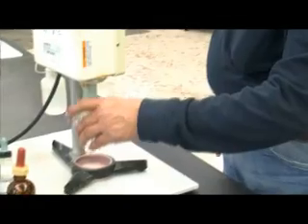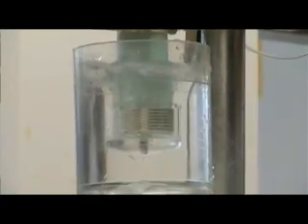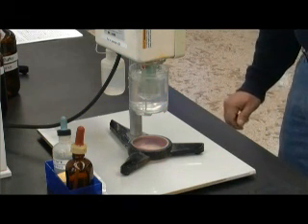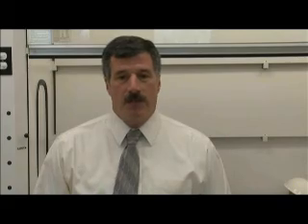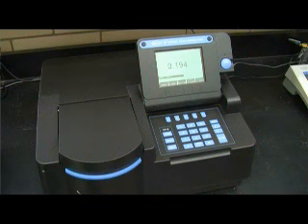Testing for turbidity and maintaining an appropriate chlorine residual are considered to be the 2 most important parameters in providing safe drinking water. The water quality lab also tests samples of the finished water to determine the level of fluoride and phosphate. In accordance with state law, fluoride is added to the water to help promote good dental health. The lab performs testing to make sure that the level of fluoride in the water is within the concentration range established by the state. Phosphate is added to the water to inhibit lead and copper corrosion, minimizing the level of these metals in the water.